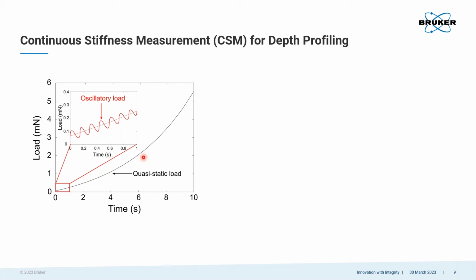So because we're going to need to measure the strain rate dependence of these, we're going to need to define what the strain rate of Berkovich indentation is. So for self-similar indenters like the Berkovich indenter, our strain rate is defined as h dot over h, which is the displacement rate divided by the current displacement.